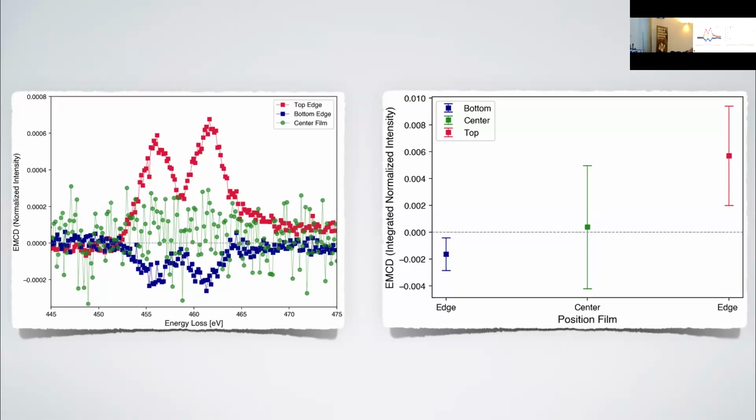I believe that is not the case because we have also done measurements with respect to the on axis, and there the signal is 0. What does on axis mean? Basically, you can measure the magnetic signal by putting the detector away. But you can also put a detector in the middle and measure current. When we measure the current, which would be the accumulation of current due to the effect that you're talking about, the signal is equal to 0. So that is why it's not that effect.